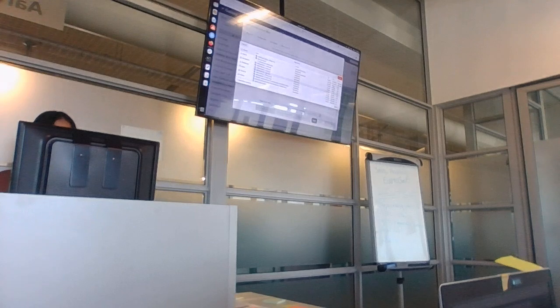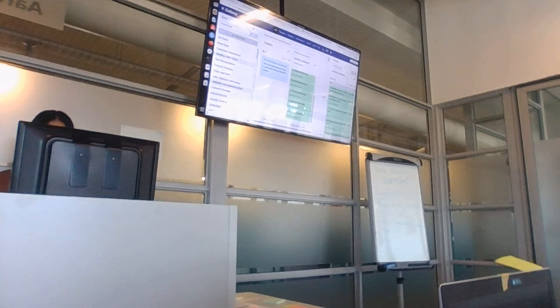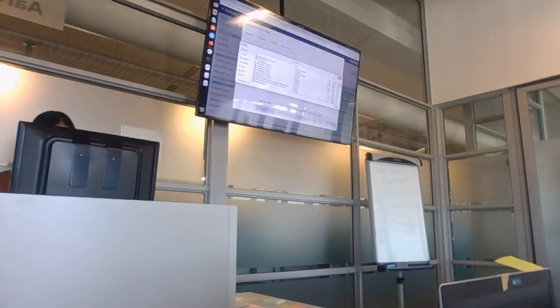Upload this file to, this is bad practice, but this is just kind of to show you. Upload it to this cholera dataset history. Yeah, no, but click open.